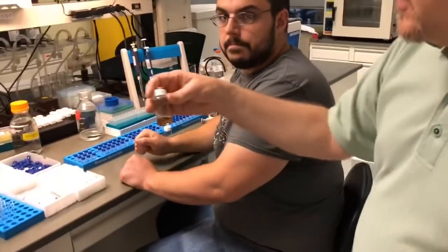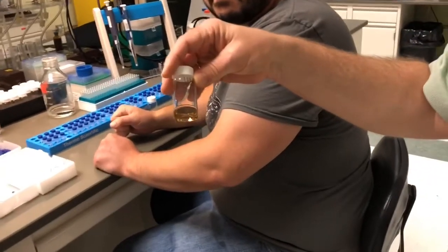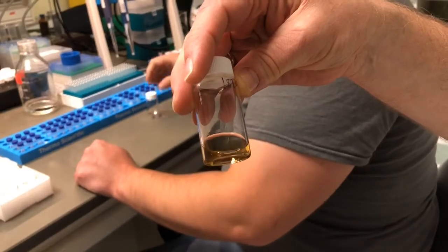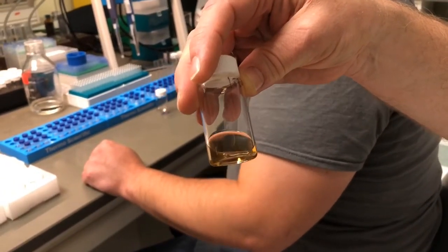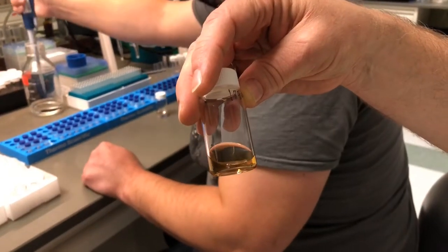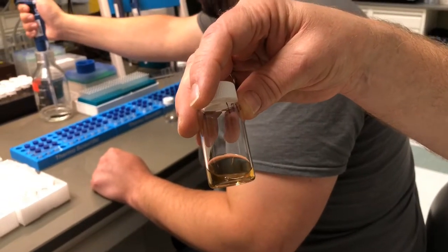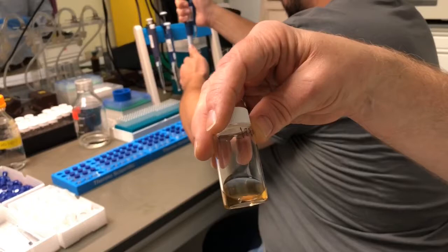So basically, this could be a concentrate that's been extracted in an organic solvent, so the CBD or the THC is now in a dilute form, and then we're going to make subsequent dilutions of that so that it's more amenable to our measurement system.